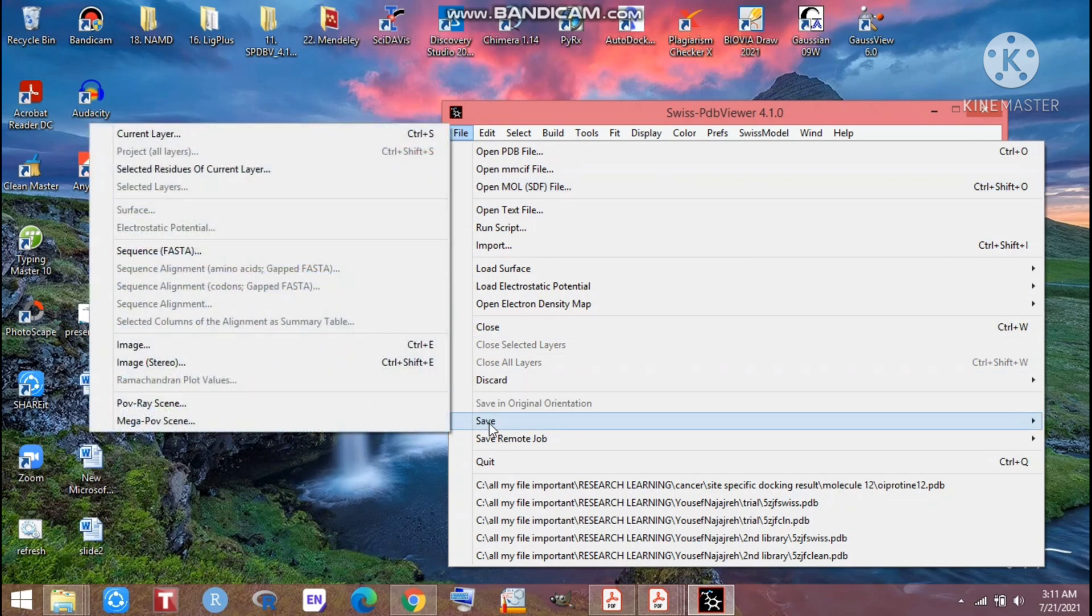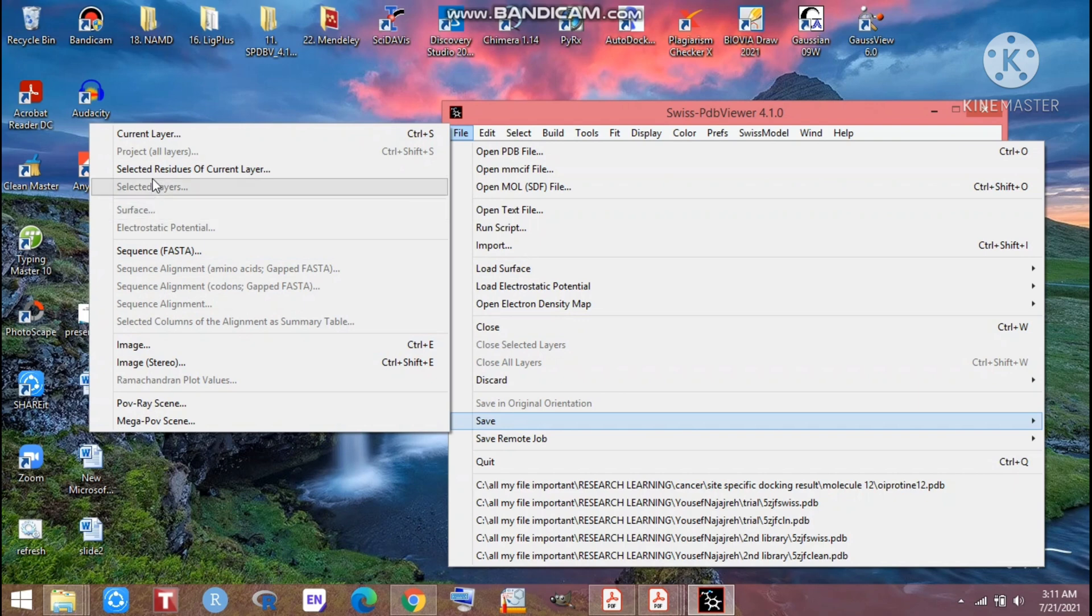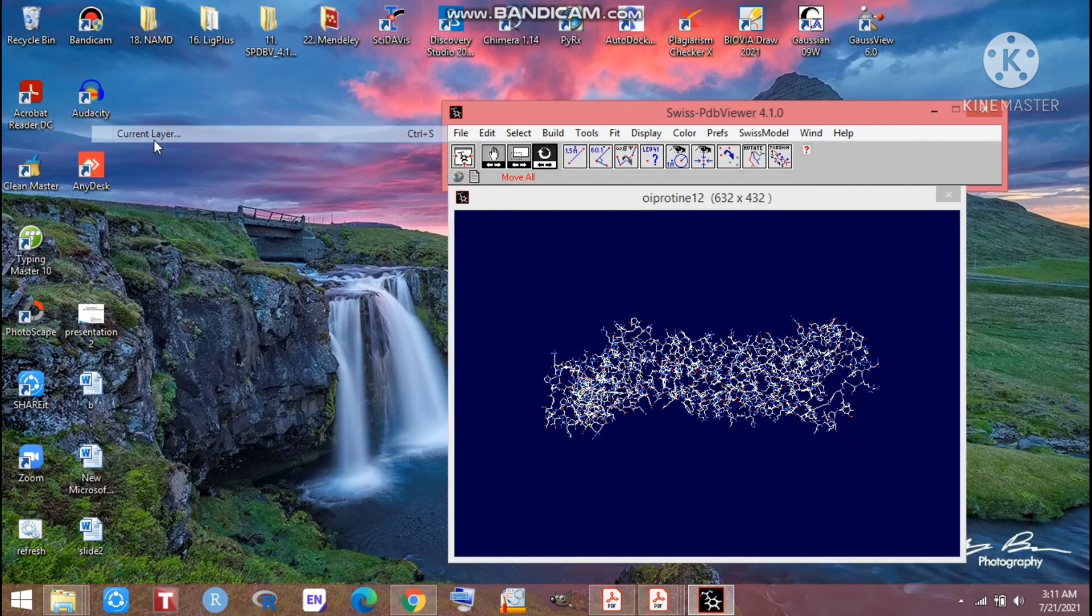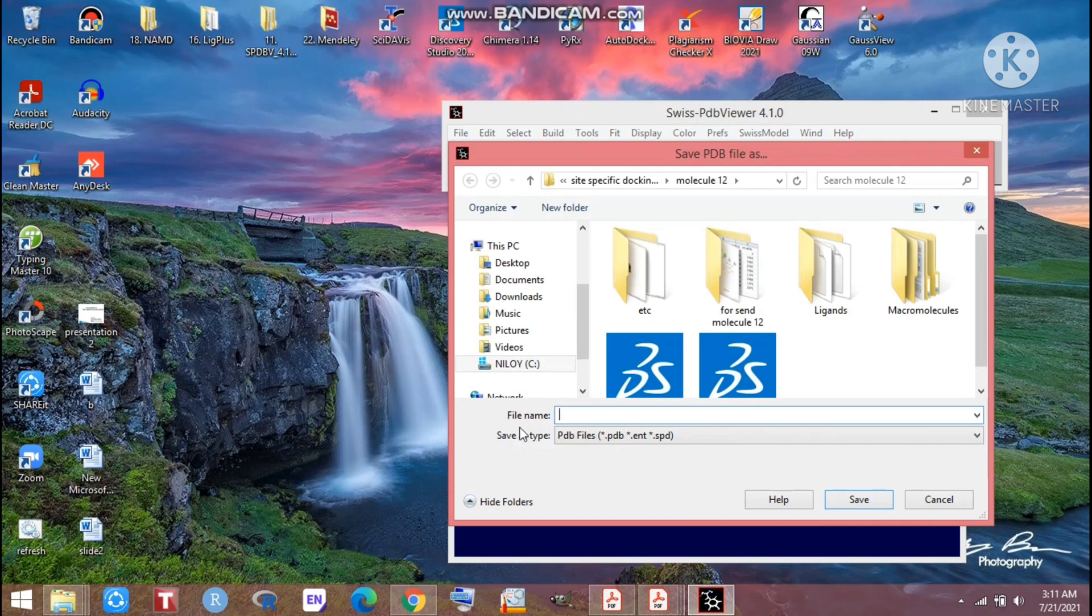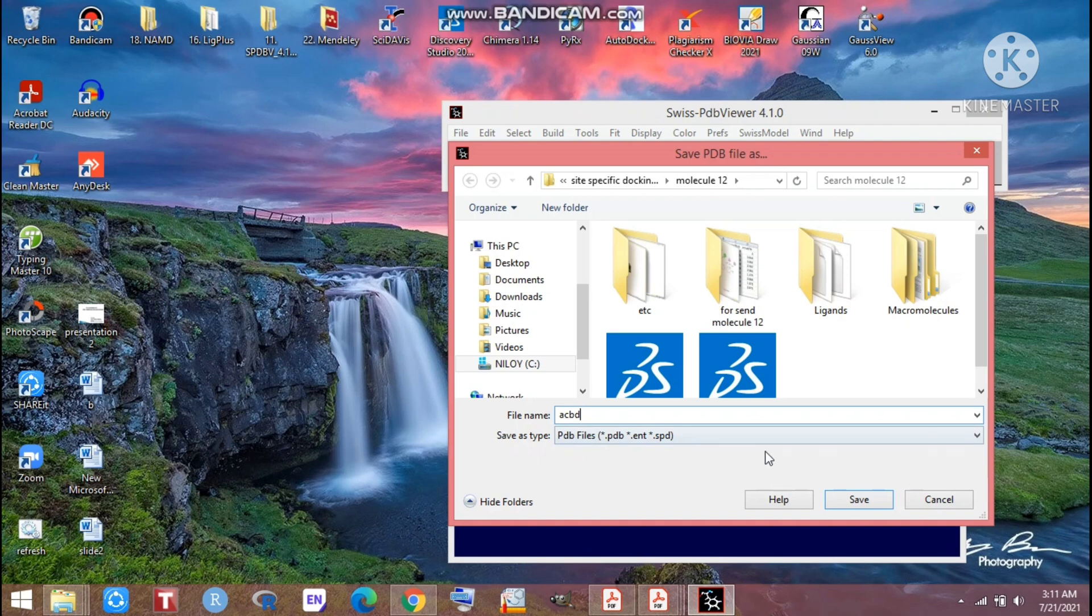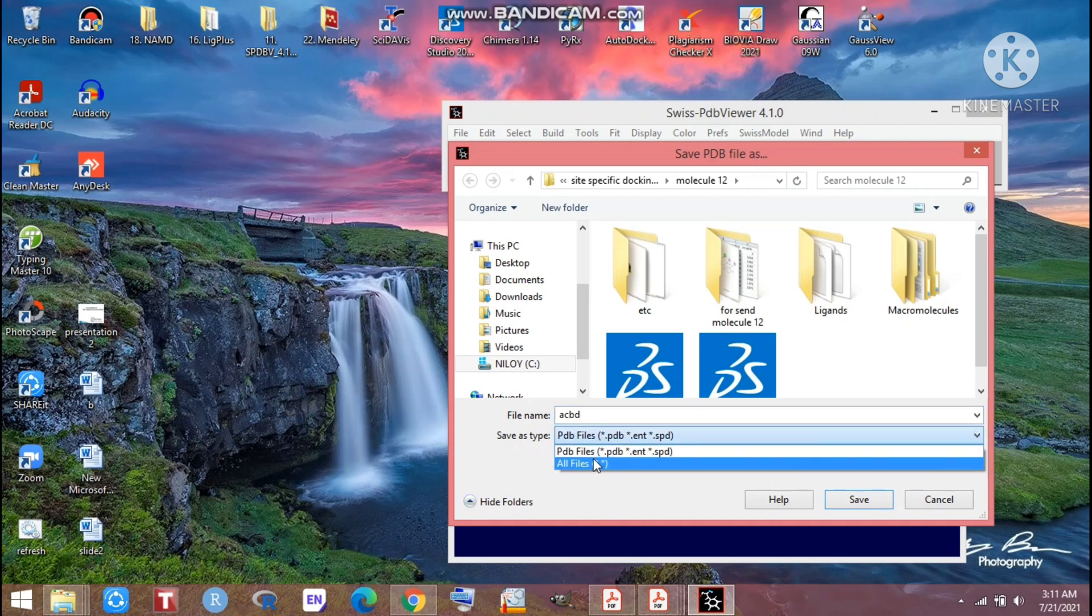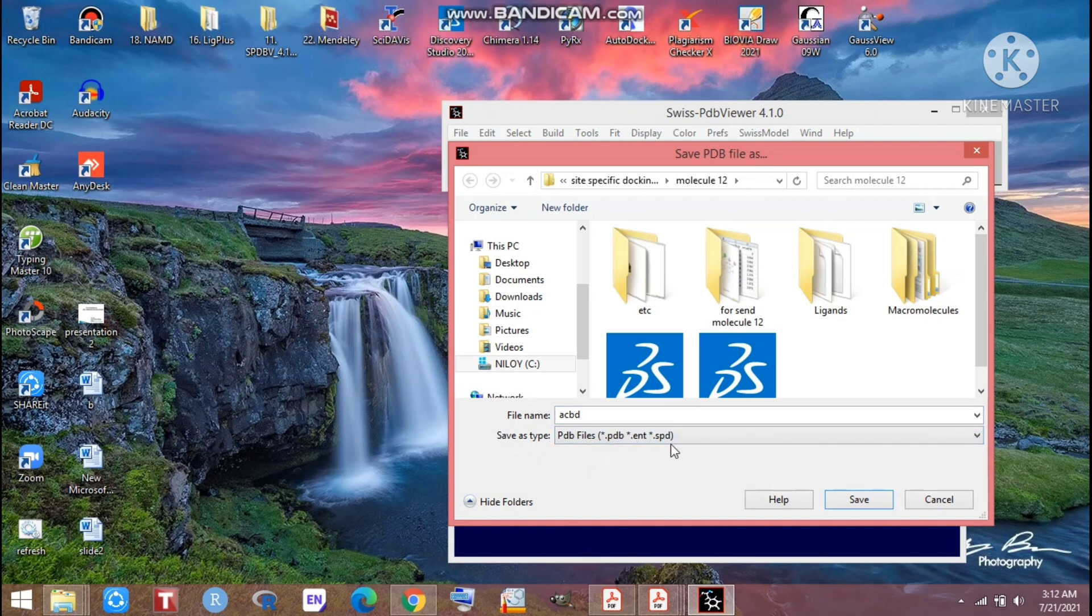After going to Save you will get this kind of window. From there just go for current layer, not anywhere else. After going to the current layer, just click here. There is a file name, you can use PDB or what you want. After completing the file name, there is PDB file format. I have to select the PDB file and just save it.